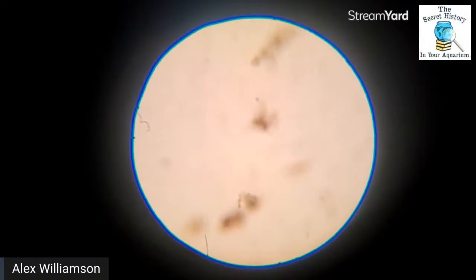And then down below, the smaller guys, these little teeny guys, are usually so small that they don't need to use much energy to move through the water. They don't have hardly any resistance. They're down at that teeny tiny level. Oh, I just saw a stentor up at the top making an appearance. Oh, maybe not. We'll see what it is, but it's eating those little things. We'll wait and see if it makes an appearance. If not, we'll shift it down in just a sec.